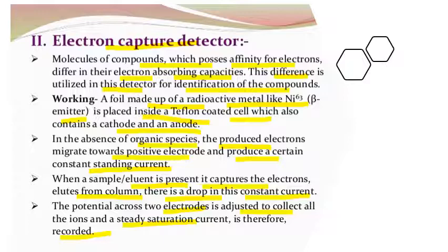Its sensitivity is 10 to the power minus 9 to 10 to the power minus 12 grams. This is the sensitivity of the ECD.